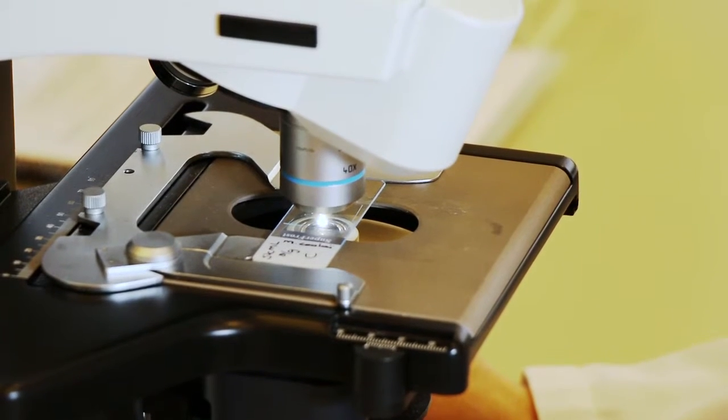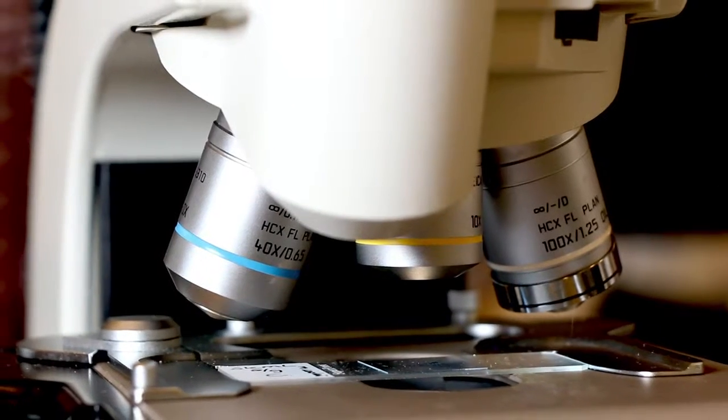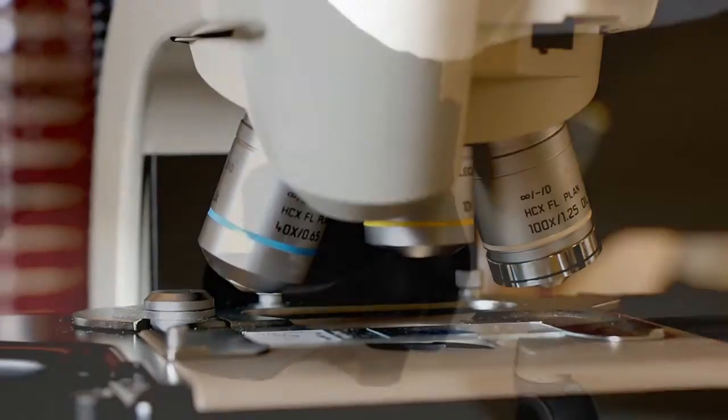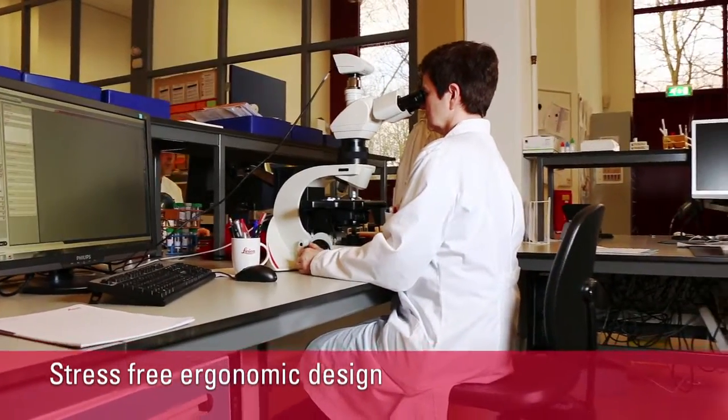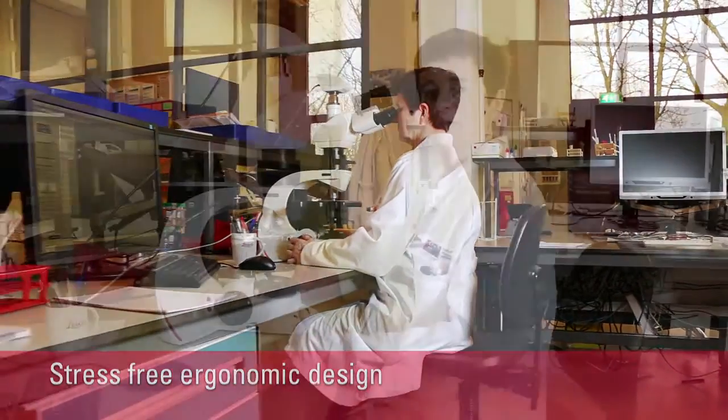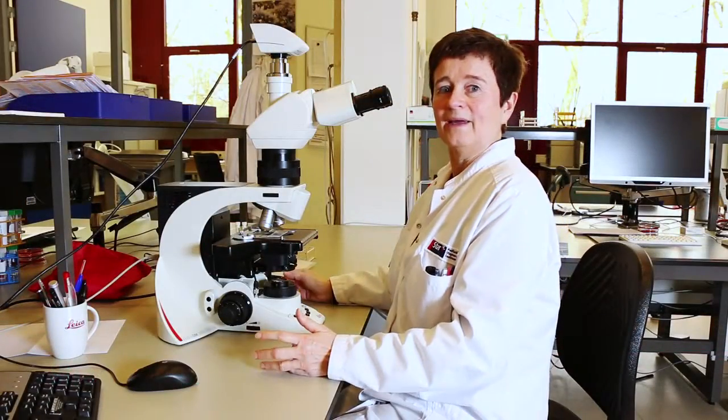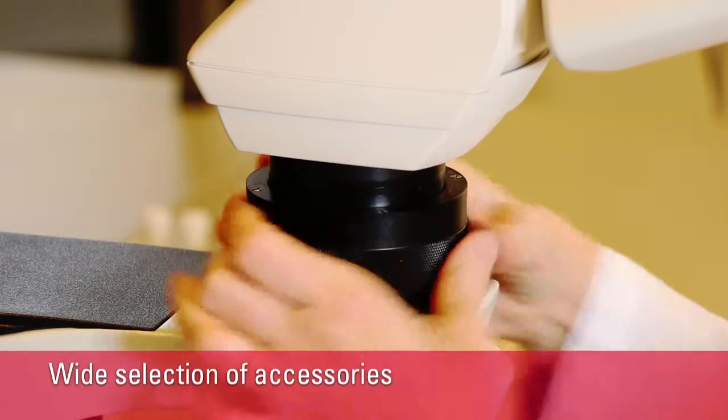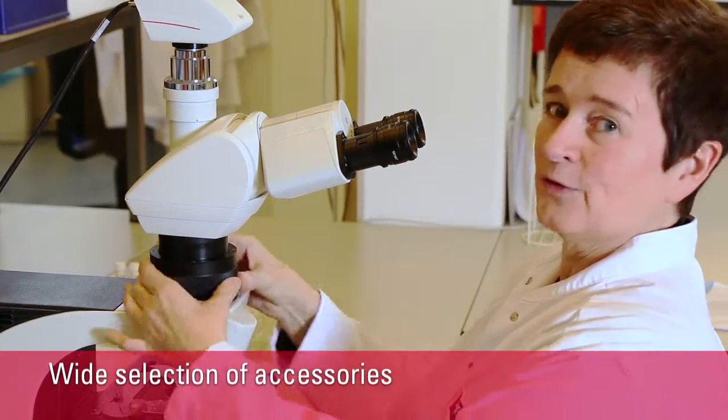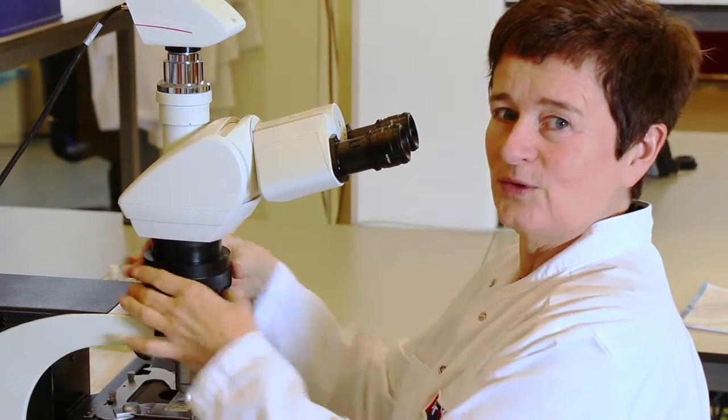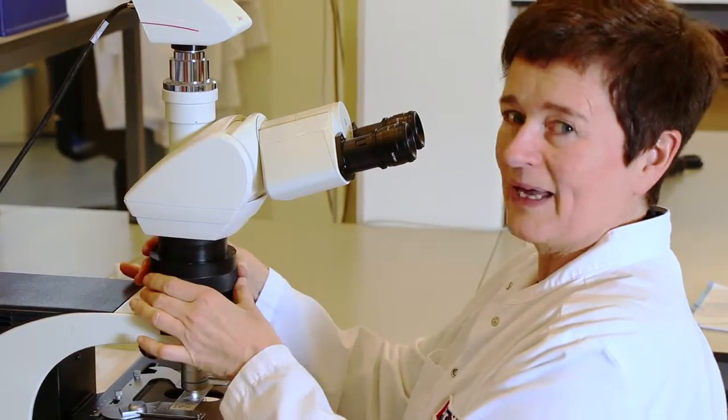We have been using Leica microscopes for many years now. This one is a big improvement because you can adjust it so you can look straight into the microscope. When you are working long you don't get a sore back. I can also adjust the height of the oculars by turning this ring. It's handy for very tall colleagues so they can also use the microscope without getting a backache.